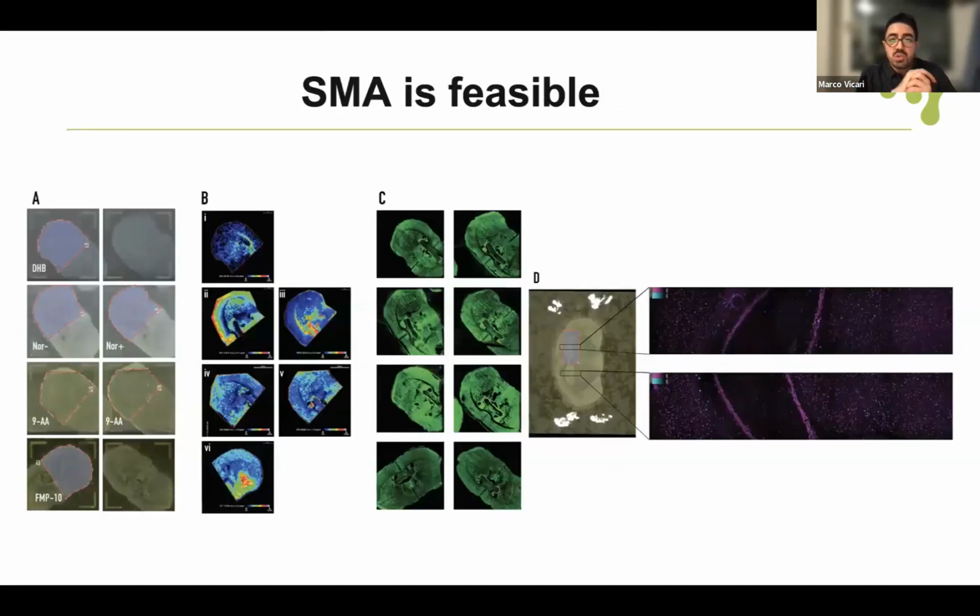And here I'm showing you the first pilot experiment that we did. We cut 8 mouse brain tissue sections on a Visium array that contains 8 capture areas and not 4. This is an array that can be used just to check the quality of the RNA, because this kind of experiment doesn't end up in a real Visium sequencing experiment. You just perform a reverse transcription using fluorescent nucleotides, and then you get a fluorescent signal.